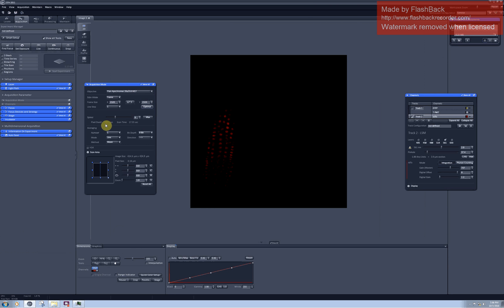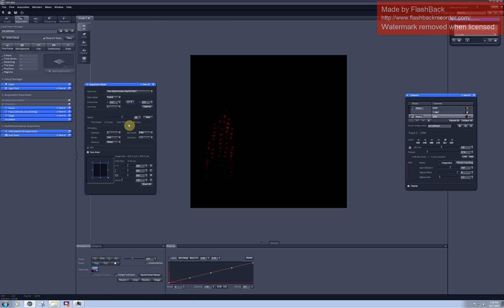But then you will see that the scanning time has dramatically increased. So it was first 780 milliseconds and with optimal resolution it will be 18 seconds.